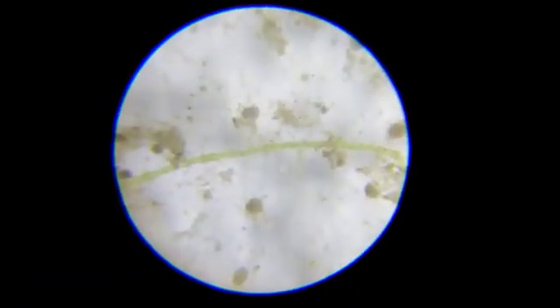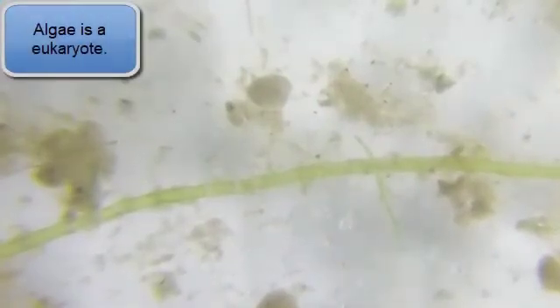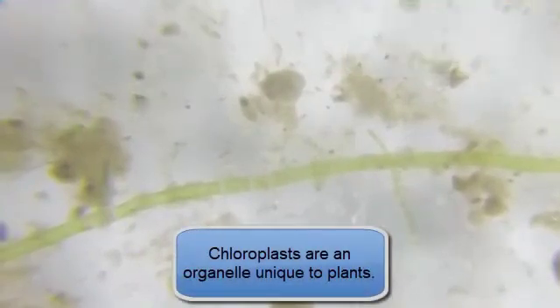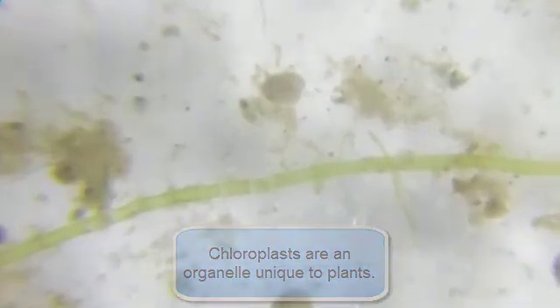So what we have here right in the middle is some algae. So algae is a eukaryotic organism because the cells do contain a nucleus, and it also has other membrane-bound organelles. It has chloroplasts inside of it.